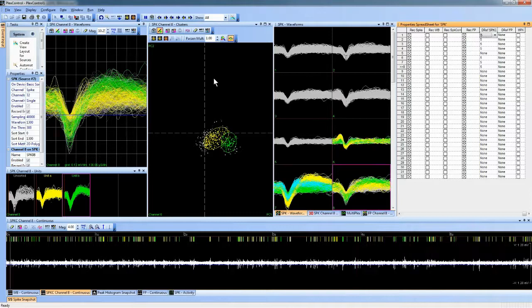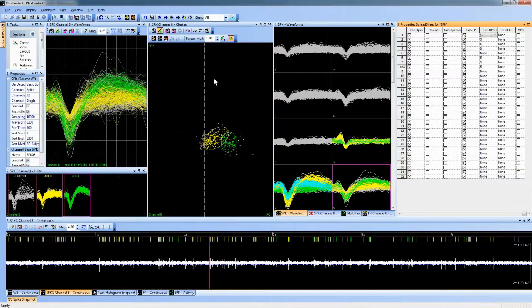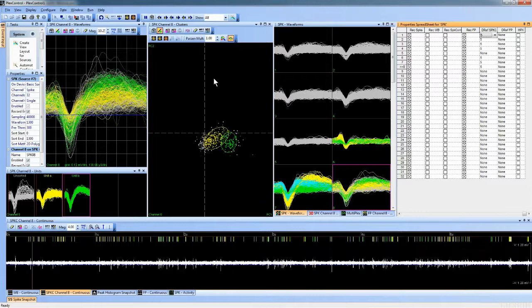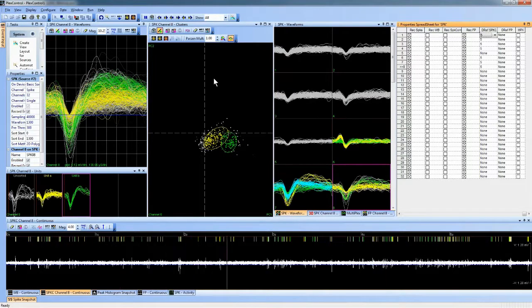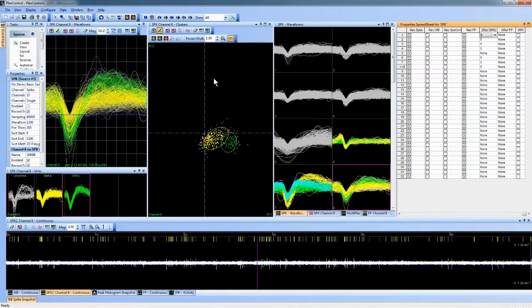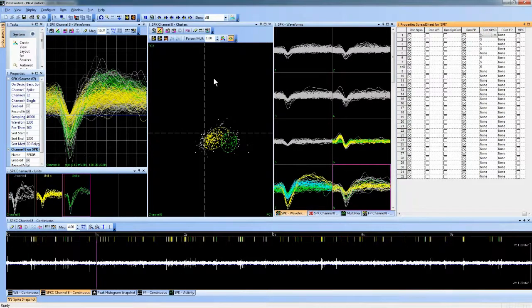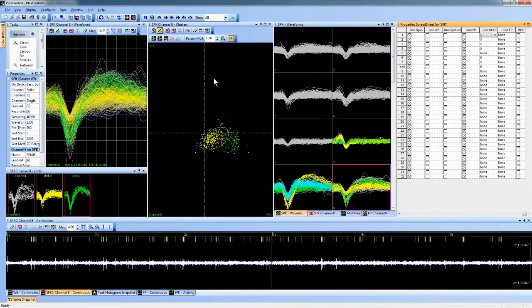It's a good question. I think there's a number of different things that you could try. One is trying this aligned extraction online. He said that he's trying the alignment offline. Trying it online and seeing what kind of results it has online could be useful. And looking at aligned extraction and then potentially adjusting the threshold based upon the results that you get would be another way of trying to better differentiate more than one neuron on the same channel.